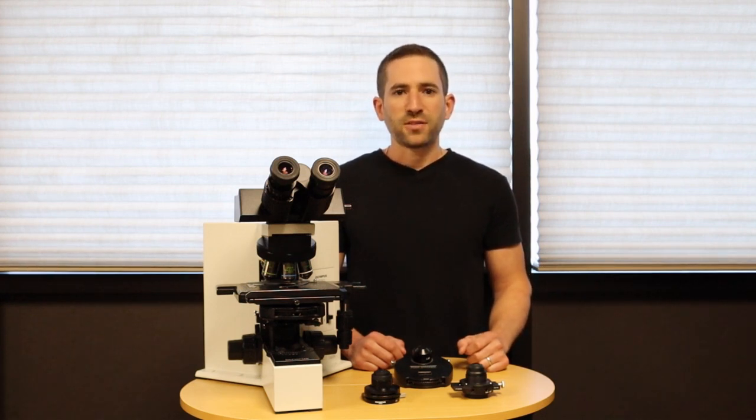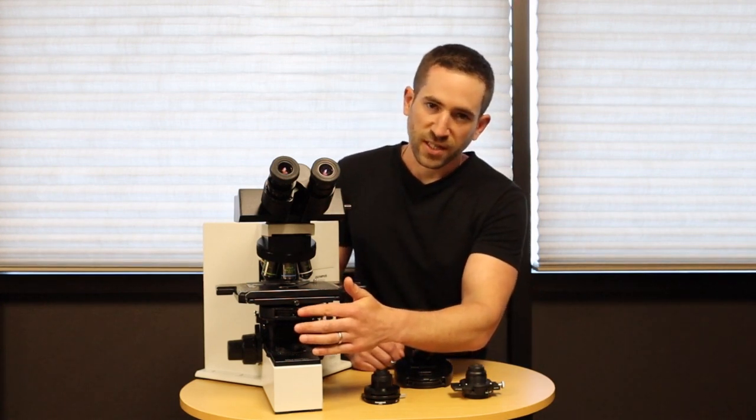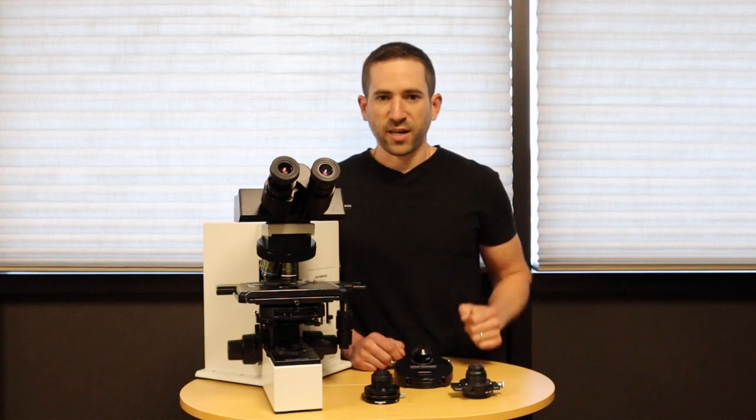There are three ways to do this. What you see on this microscope is called a phase turret condenser. So when you rotate the objective, you simply rotate the wheel to match the phase annulus to each objective.